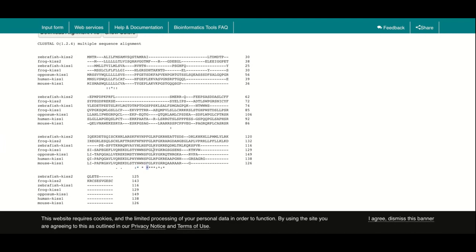Let's see over here, another star. They're all F's. So you're figuring out what the star means. And you noticed already that when there is nothing down here, hopefully you realize that means there isn't a lot of conservation. Conservation means the amino acid in that position stayed the same. When there is no conservation, the amino acid changed.